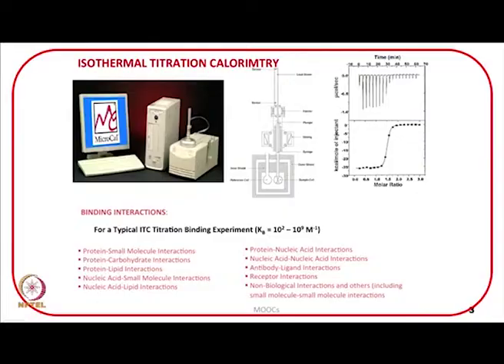In short, when anything is mixed with another thing, there is going to be some heat change. And if we are able to measure that heat change, we can connect it with the mechanism of the process. That is our purpose in these discussions: to understand the processes both qualitatively and quantitatively in terms of the thermodynamics involved.